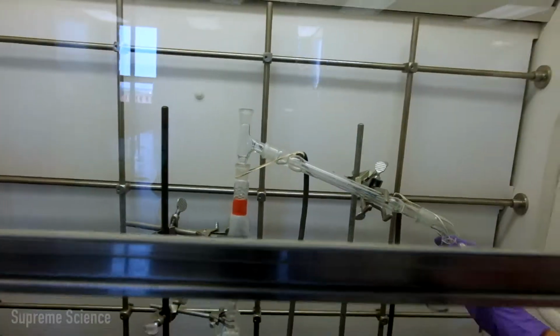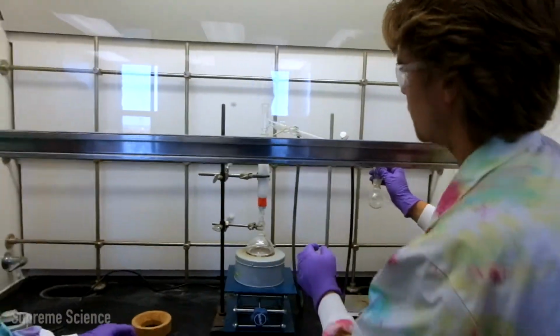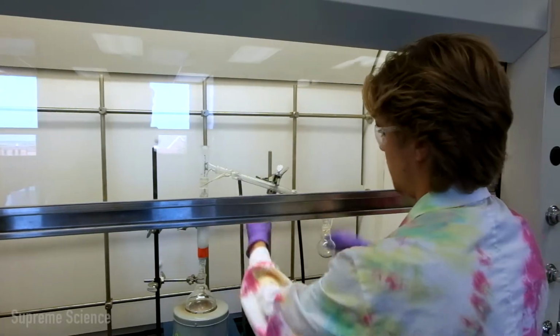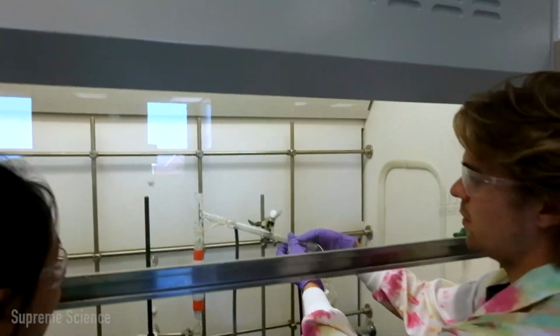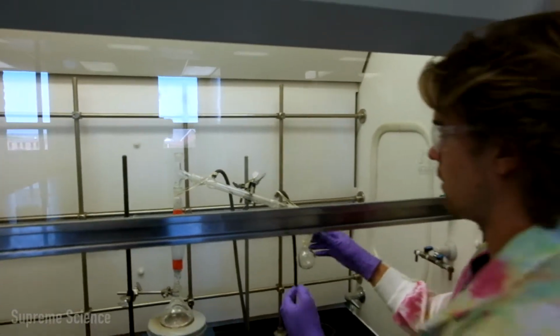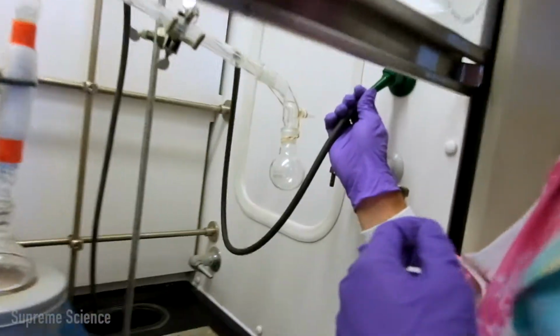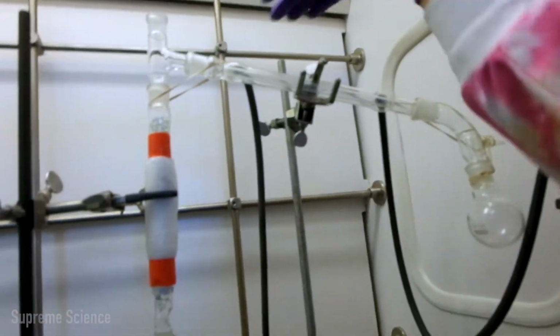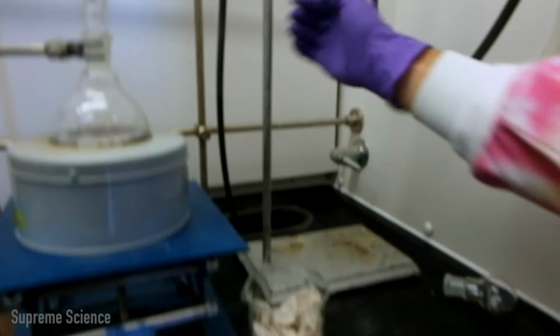We want to make sure that everything is straight, that the column is in a vertical position, and that our clamp is supporting our condenser in the center. We also want to make sure that our tubes are pointing upwards so that the condenser completely fills with water. So we have the water connected from the water inlet to the bottom of the condenser, and then the top of the condenser to the drain.